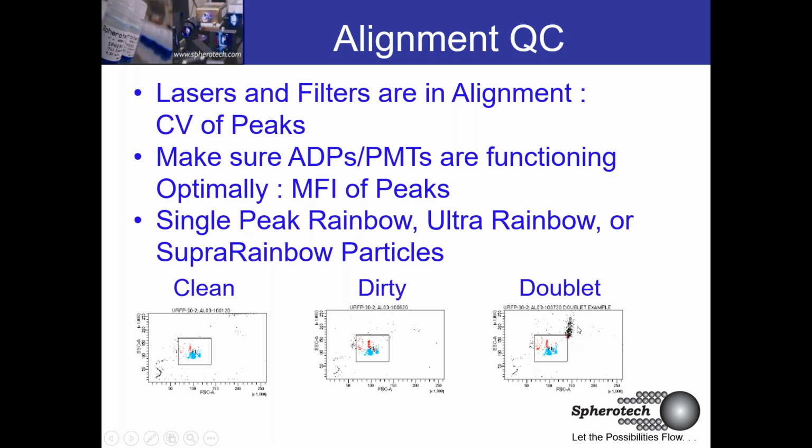But when you see a population like this, I just wanted to include it as perfectly, or almost rather, diagonally, linearly from your main population. There's a good chance this is a doublet as opposed to just debris, right? So if you're only getting like 60%, 70% singlets here, this might well be a doublet population that we need to vortex, right? We were talking about agitating the particles. A lot of times with a bit of agitation, this will come down. Now, if it's not on this kind of line, on this linearity here, there's less of a chance that it's a doublet, but just as kind of an example.